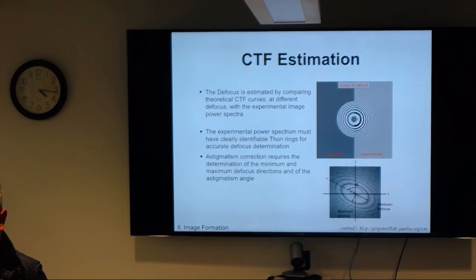So you do the range of defocus values so that you can sort of fill out the CTF, because you're going to take all of your particles, and each one of those is going to come from a micrograph with a certain CTF. So certain frequency information is going to be missing from that single particle in your image. So you combine all of them to try to get your 3D structure. You want to have information at all of the resolutions possible.